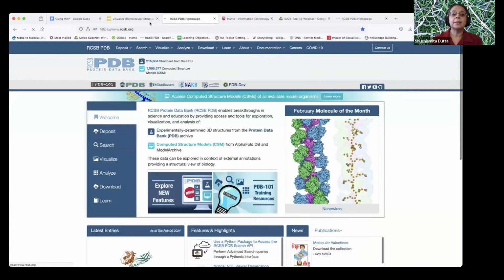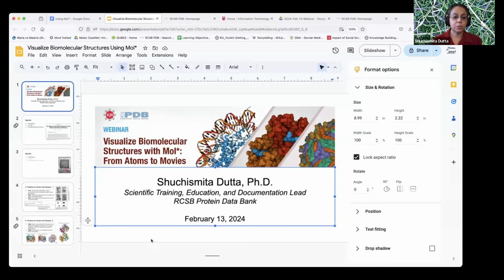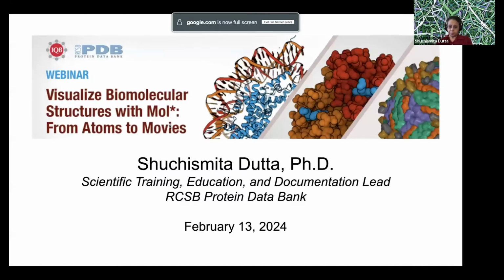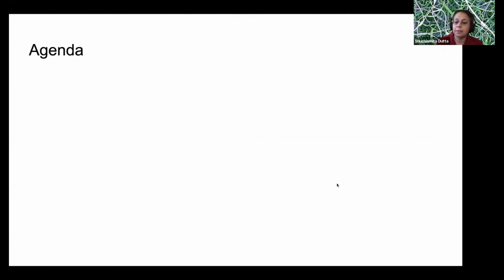So with that, I'm going to begin today's tutorial or webinar and get into slideshow mode. As I was preparing the agenda for this webinar, I was looking for a story, something that we could use to showcase the MolStar features and functions that we have.